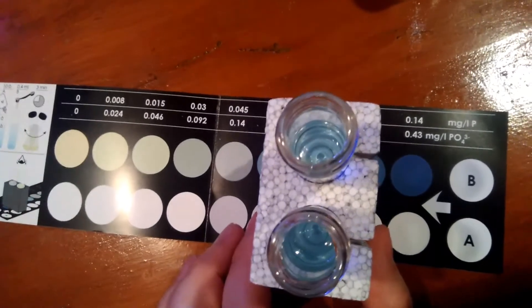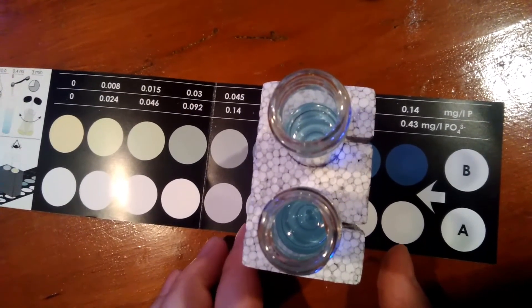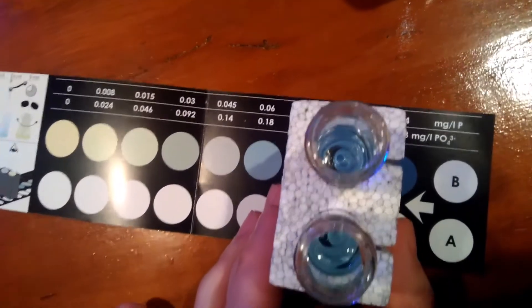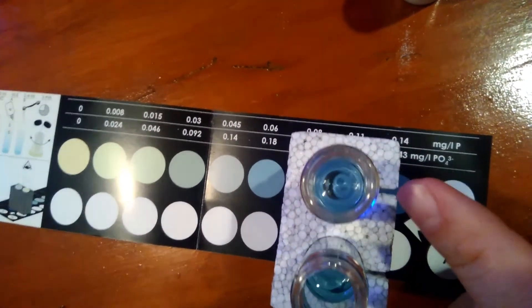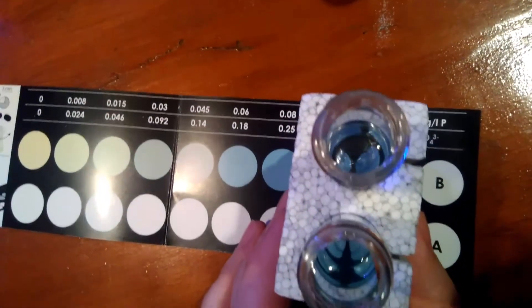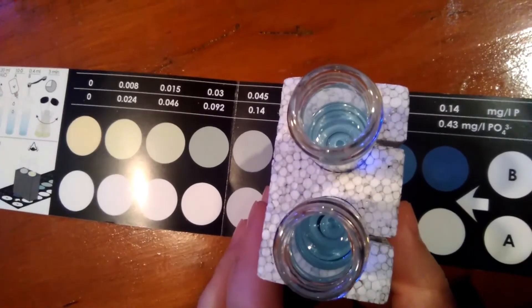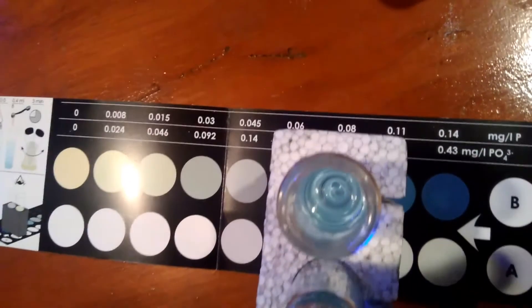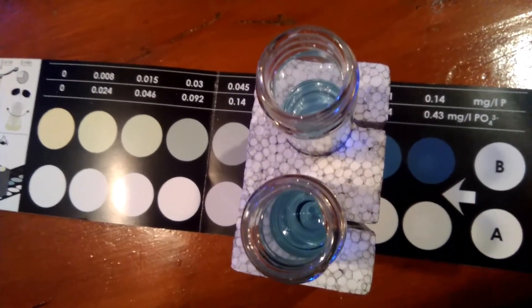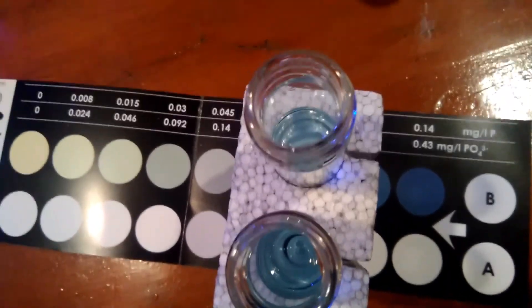I'm going to show you exactly how easy this is — see how the water right here changes color as I figure out which one mine matches up to. That's all you've got to do. You wait three minutes and you get your color results. Mine is looking at 0.08, so that's what my phosphates are. It's pretty much not going to change too much within the first few minutes, but that's pretty much the results. Pretty easy — it's 40bNasty out.